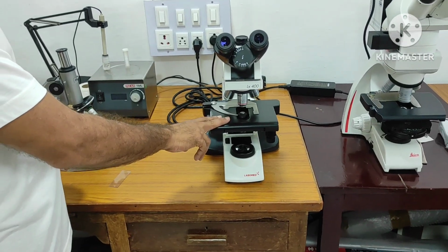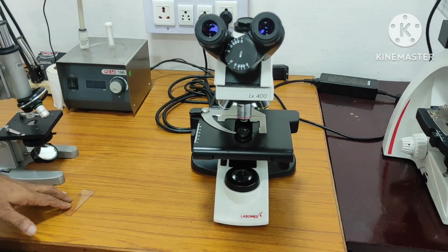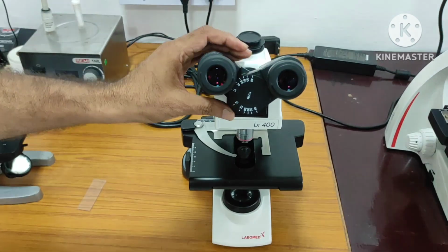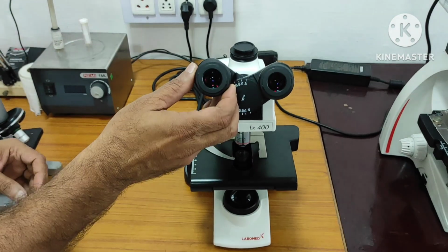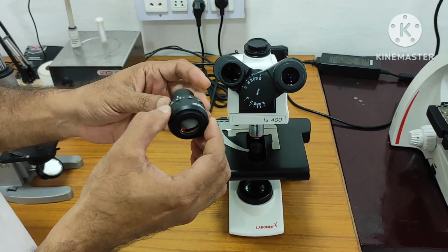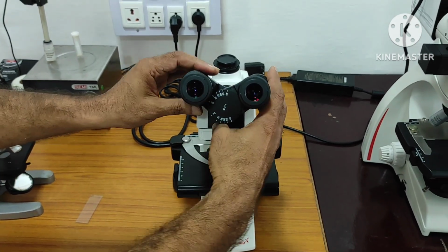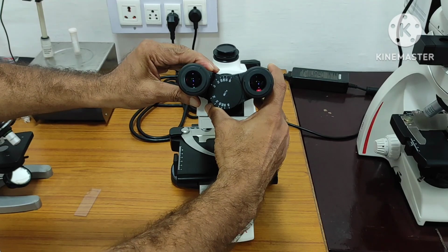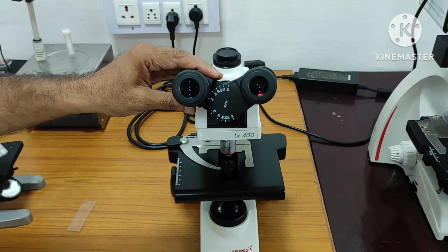This is another type of compound microscope only. The difference is here, you can see here binocular, right? Two eyepieces are there. These are also replaceable only. We can change it, right? And based on our requirement we can adjust. Many things are adjustable here, right? And even based on our eyes also we can adjust like this also, right? So distance in between two eyes we can make it.